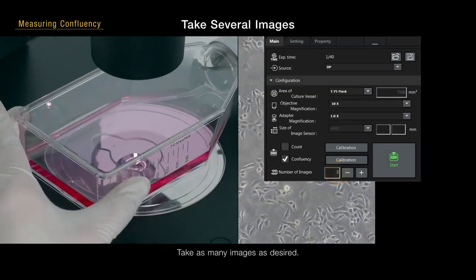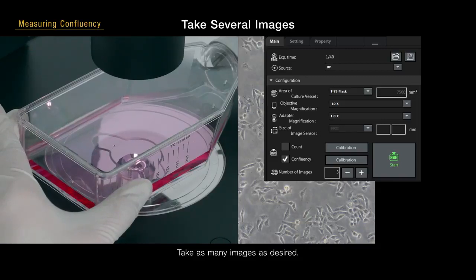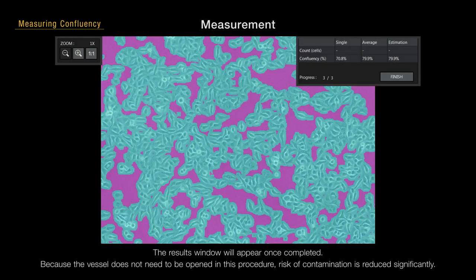Take as many images as desired. The results window will appear once completed. Because the vessel does not need to be opened in this procedure, risk of contamination is reduced significantly.